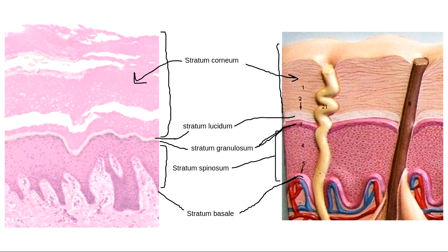Yeah, so Jacqueline asked a good question. We won't see that gray line layer in thin skin. That's correct. You will not see this specific layer of cells when we're doing thin skin. What we see on thin skin sometimes is an open space where the cells fell apart. They're not there anymore. But that's not stratum lucidum. Stratum lucidum is when there's actually cells there.